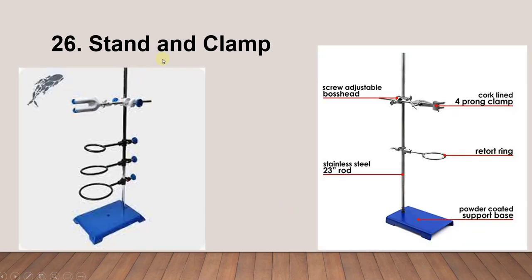Next is the stand and clamp. This is the stand and this is the base. We have different shapes of clamp. Here you can see three different sizes of retort ring. We also have the four-prong clamp type.